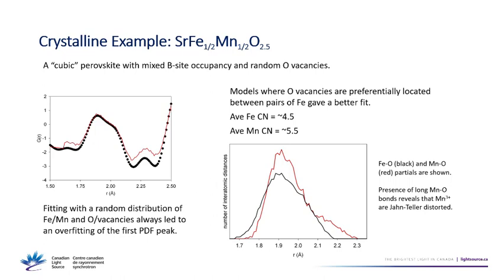If we change the atom scattering factor obtained from X-ray to the atom scattering factor obtained from electron scattering, can we do the same calculations for diffraction patterns obtained from TEM, i.e. electron diffraction patterns? Because they basically look the same as X-ray patterns.